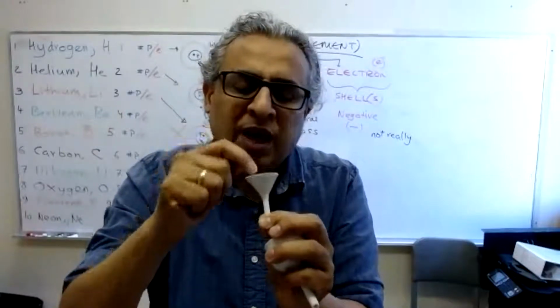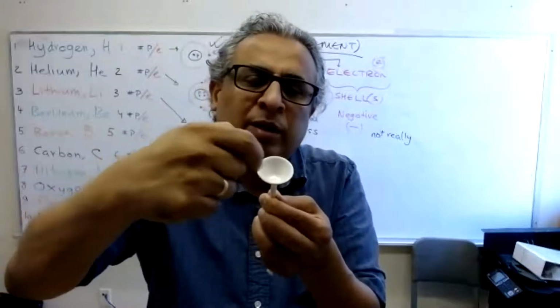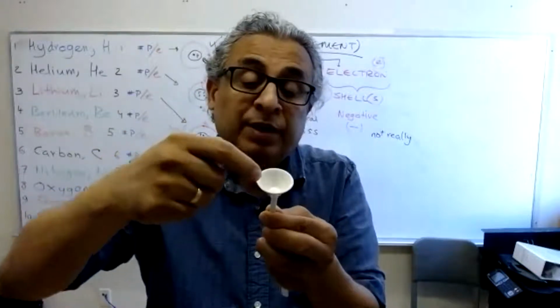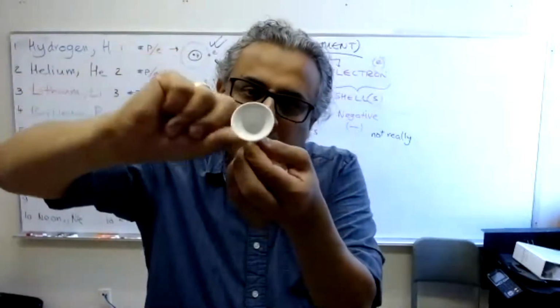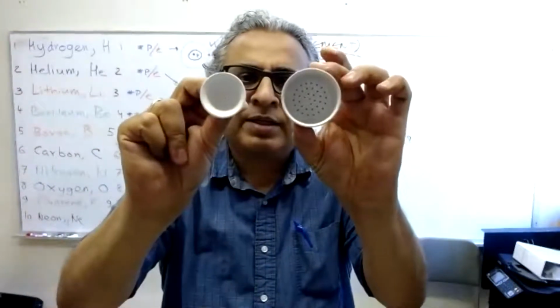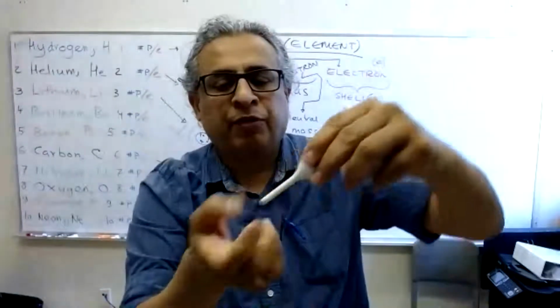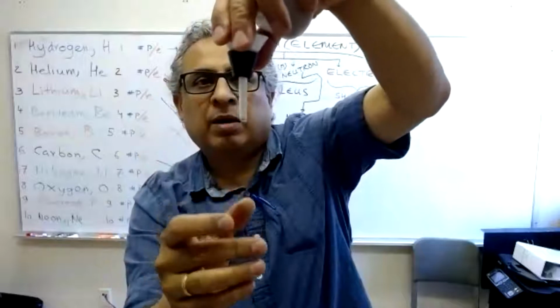You just use a tiny little filter paper, stick it there, wet it with a little of whatever solvent you're dealing with, press it down, turn on the vacuum, and it's going to sit tightly in there. Okay? Hirsch on your left, Buchner on your right. And they can both use the same adapter. This should work here too.